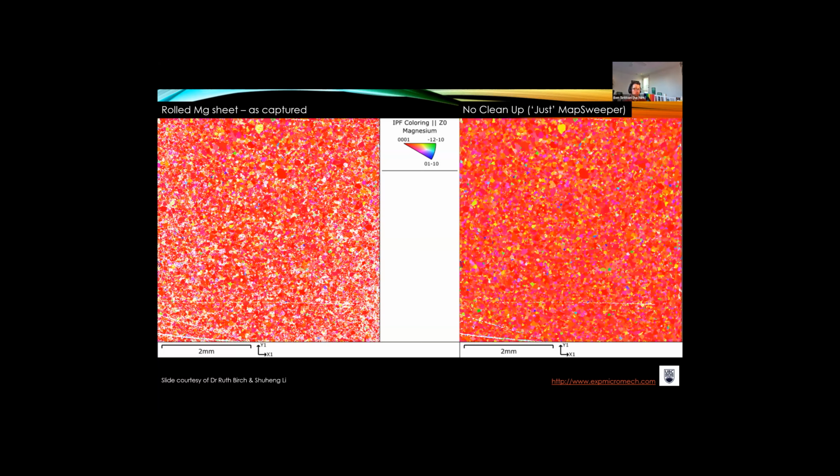Then the last bit is for charging on these objects. There's sort of three methods to reduce charging. So charging is related to the total electron dose and the energy of the electrons. So if you can reduce the voltage and or probe current, that could be helpful. So if you can run the system faster, you have a less total dose per unit time per diffraction pattern. You may compromise the diffraction patterns, but they may be more correct for the region that you want.